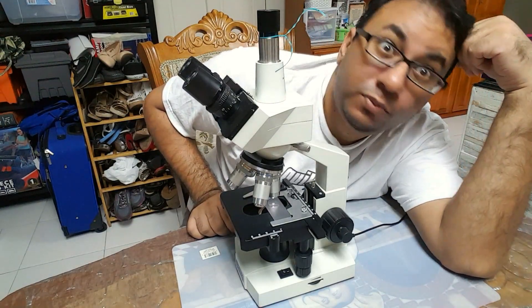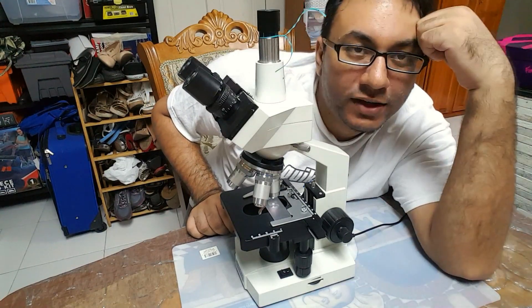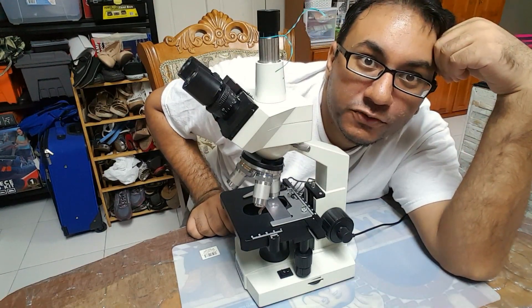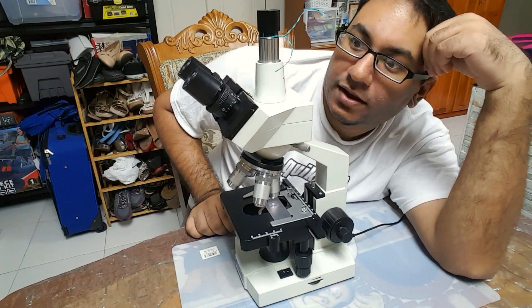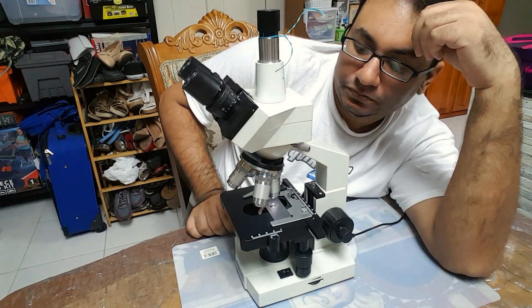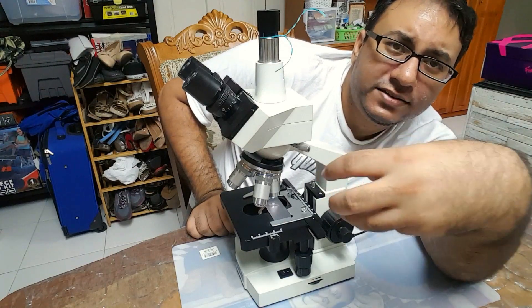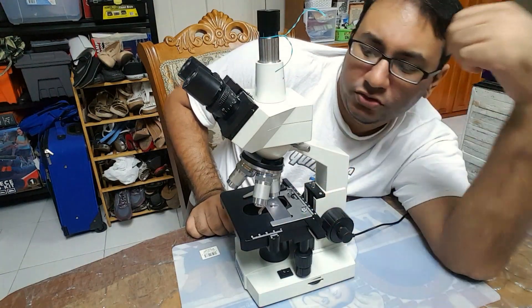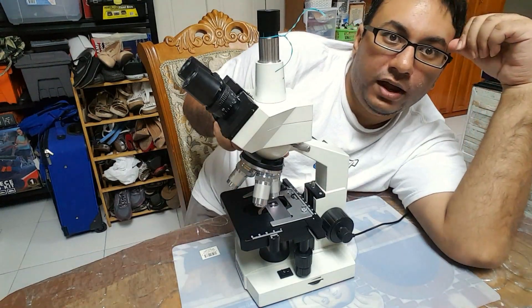I spent a little more buying the 5-megapixel version instead of the 2-megapixel, hoping to capture interesting organisms — unfortunately that didn't fully work out. Is it an absolute fail? Probably not. The microscope itself works fairly well. To view at 1000x or higher you probably need to get the special immersion oil they use for that purpose.